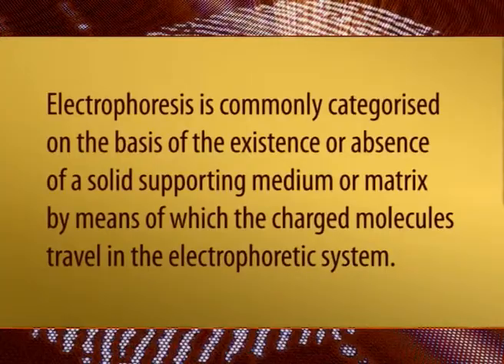Classification of electrophoretic techniques. Electrophoresis is commonly categorized on the basis of the existence or absence of a solid supporting medium or matrix by means of which the charged molecules travel in the electrophoretic system.